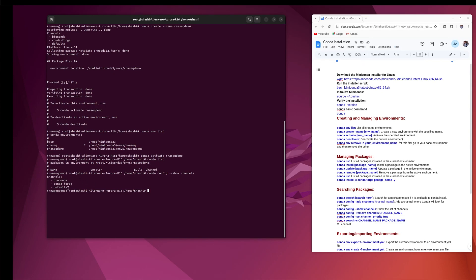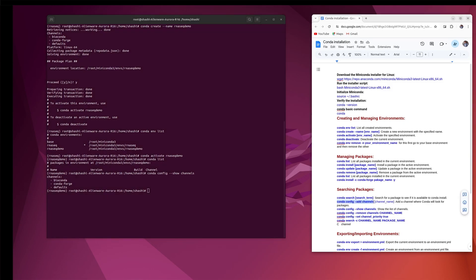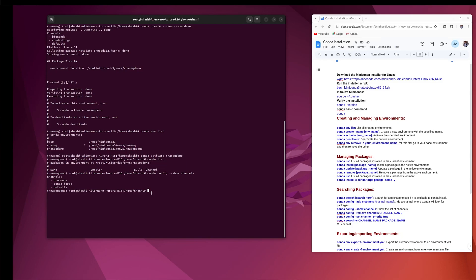An important concept is channels — channels are the repositories from where Miniconda installs packages on your system. To see the channels present in your environment, use the command conda config --show channels. You can see there are three channels in my environment. In your case, only default may be present, so you need to add channels such as bioconda and conda-forge using the command conda config --add channels, so that you can search and install packages.